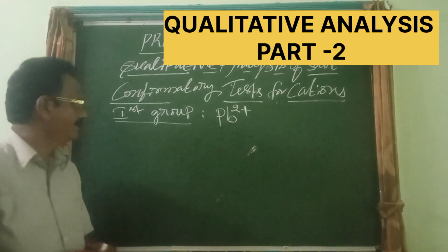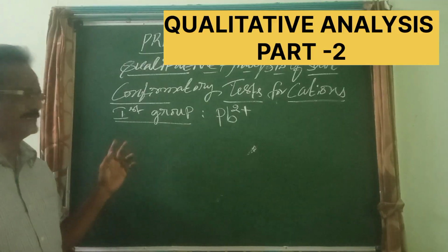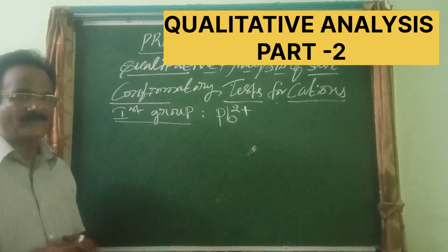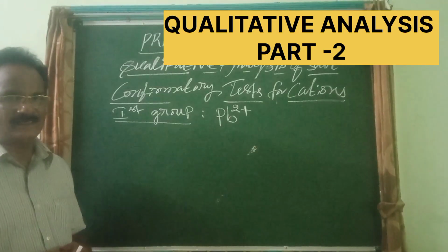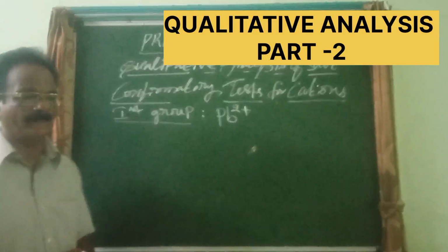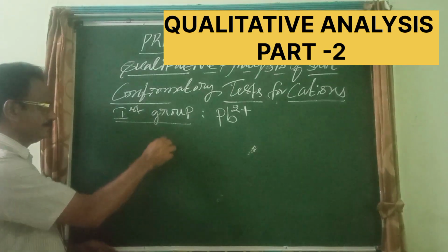Let us see, if first group cations are identified, then the confirmatory test should be done for the presence of lead.